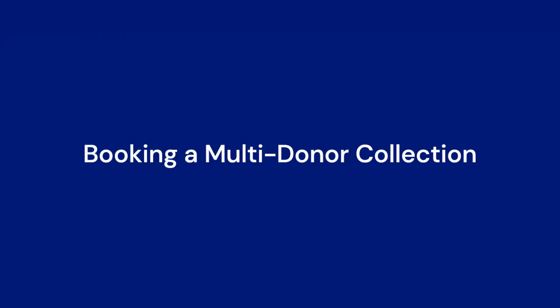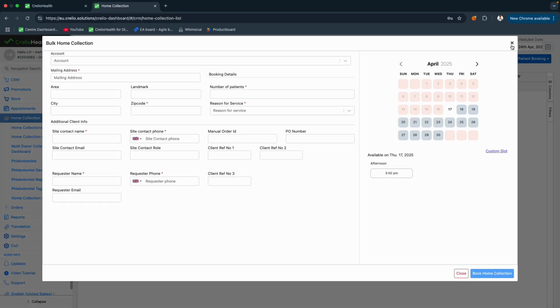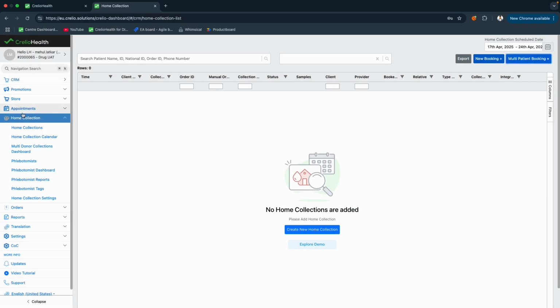In this video, let's see how we create multi-donor or patient bookings in the Crelio system. So you go to CRM, you go to Home Collections. On the Home Collections page, you will see two options, New Booking and Multi-Patient Booking.